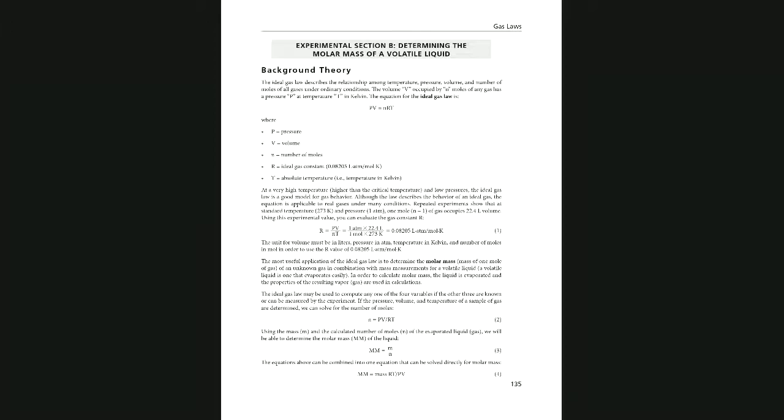Hi, this is Dr. Mamari, and I'm going to perform experiment 10, part B, which is determining the molar mass of an unknown liquid using the ideal gas law. When we talk about gas laws, there are Boyle's law, Charles's law, the combined gas law, and Avogadro's law.